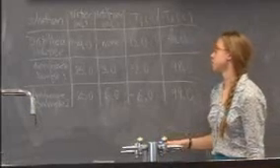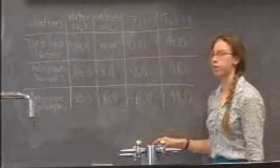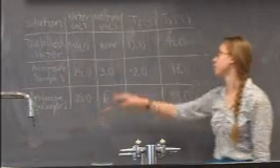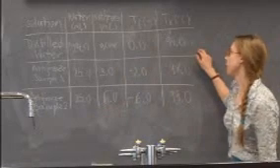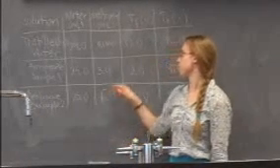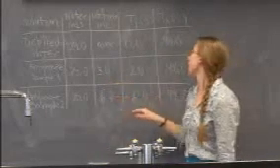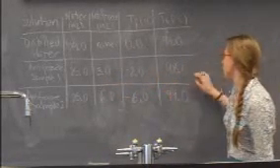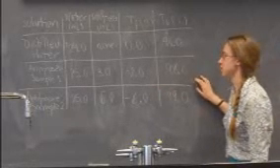Alright, so in our final results, we collected the freezing and boiling points of 3 solutions. The first is just distilled water, and that froze at 0 degrees Celsius and boiled at 94 degrees Celsius. Next, we have an antifreeze solution with 3 milliliters of antifreeze, and that froze at a lower temperature at negative 2 degrees Celsius and boiled at a higher temperature at 98 degrees Celsius.